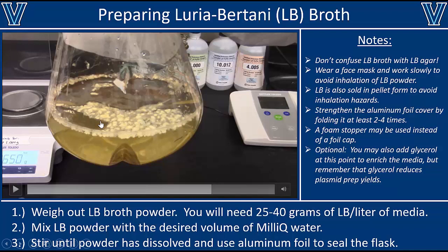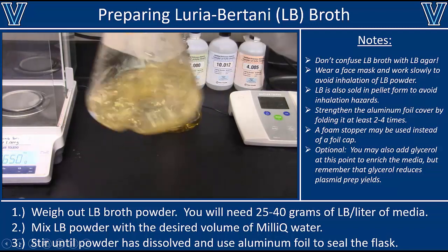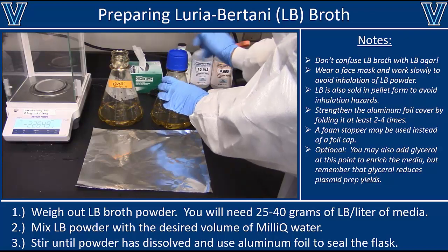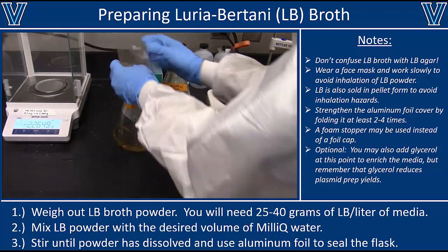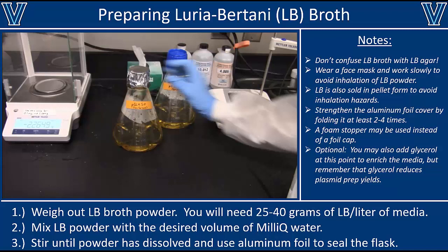You'll notice that there are still some chunks of LB powder floating around — don't worry about that, you don't have to dissolve it completely because the autoclave will take care of the rest. Shake it up as much as you can, then we need to cover these flasks so that once they've been autoclaved, contaminants can't float in through the top opening. You can use a lid, a sponge in the opening, or just cover it with aluminum foil — if you use foil, fold it a few times so it won't rip.